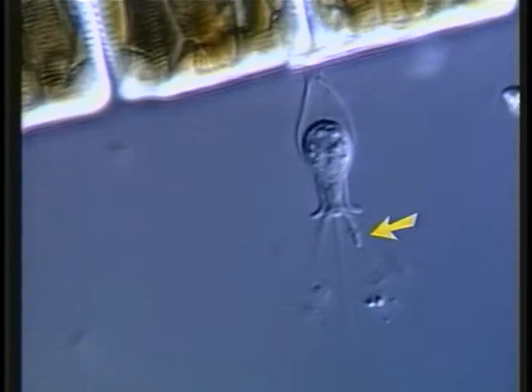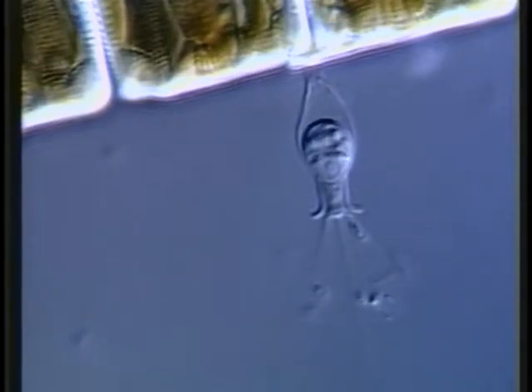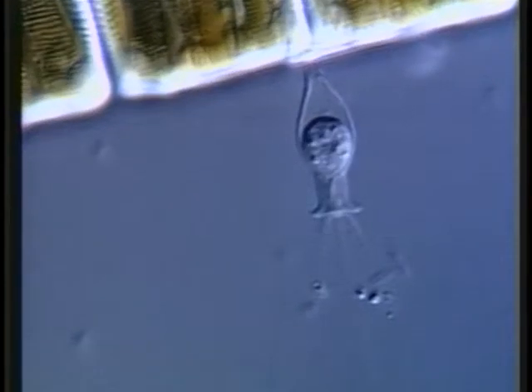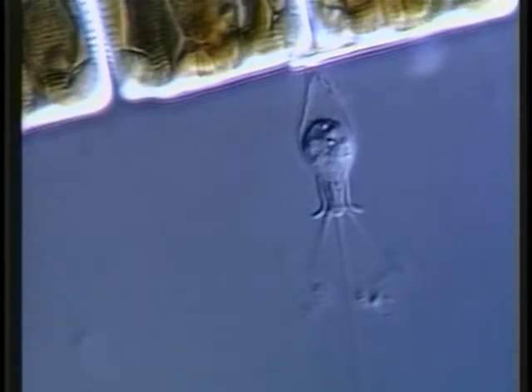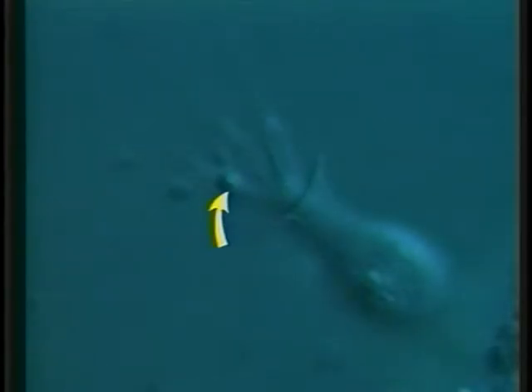This choanoflagellate, Salpingoeca species, captures and swallows food. This sequence is shown at real time. These more highly magnified sequences are shown speeded up 25 to 50 times. Arrows indicate the captured food items that are about to be ingested.